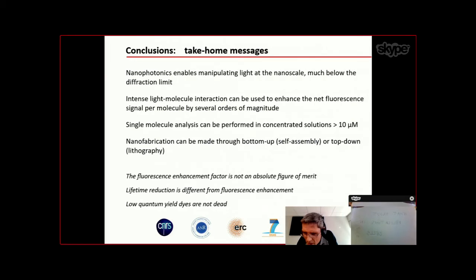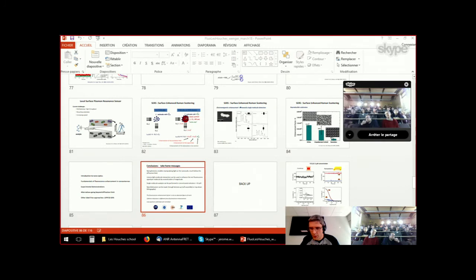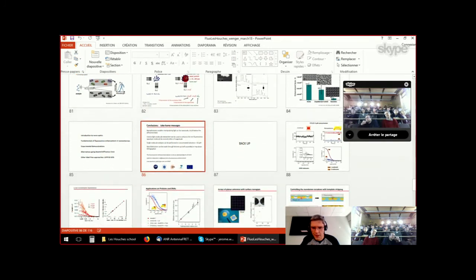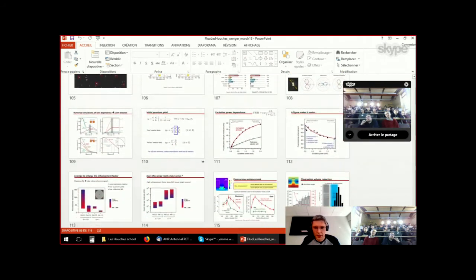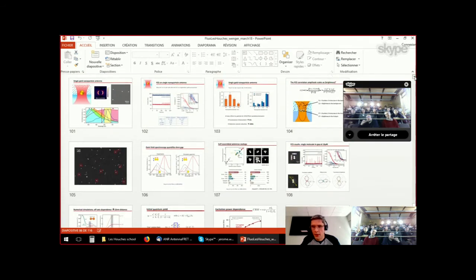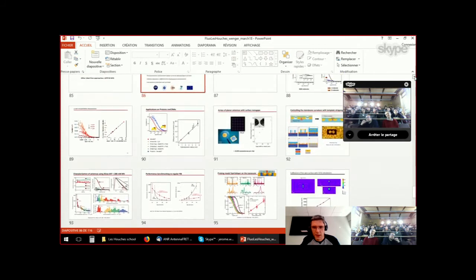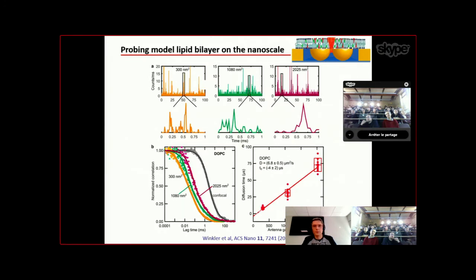What about application in cells? Application in cells, I don't know if I have this on this slide. This is some new applications that we are trying to do. So you can play with FCS on these things. I don't have the cells here. Mistake. Yes, it's possible. Actually, okay, let's play with that. How will this work?